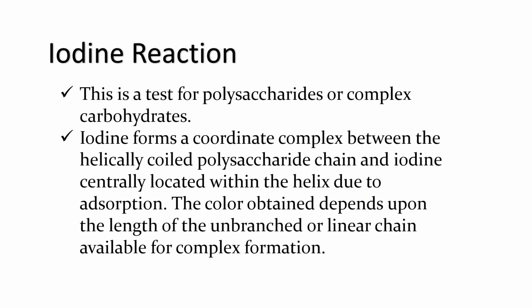Our next test is the iodine reaction, or the iodine test. Now, this one is a test for complex carbohydrates or polysaccharides. So, in the laboratory, we did this for starch. And for your DIY home experiment, you also did this in the food samples that you tested.